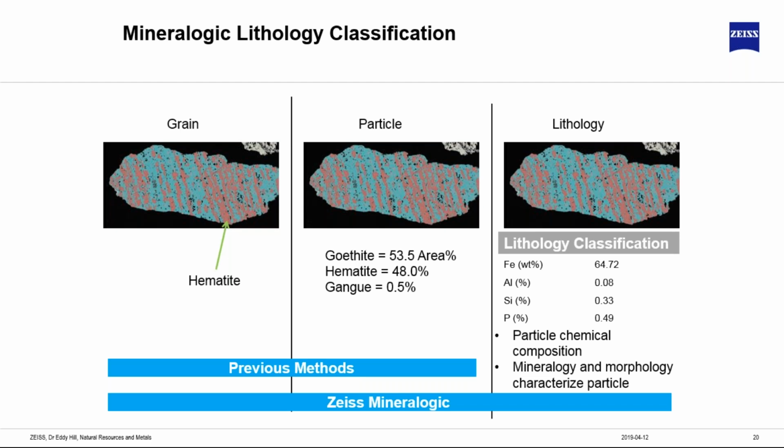And this is where MinEral Logic takes a step further and beyond what has been done in the past, what we have done up to now, indeed. We're no longer looking at the grain or a specific mineral. We're now looking at the type of particle that we're recovering in the process and how that affects our revenue.